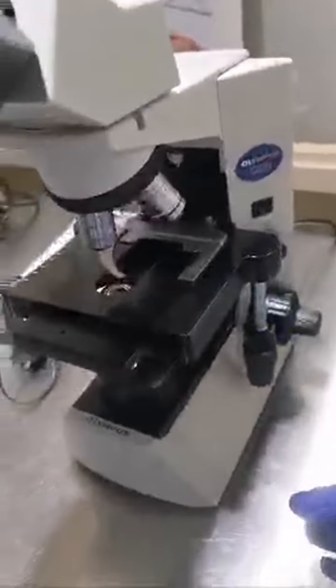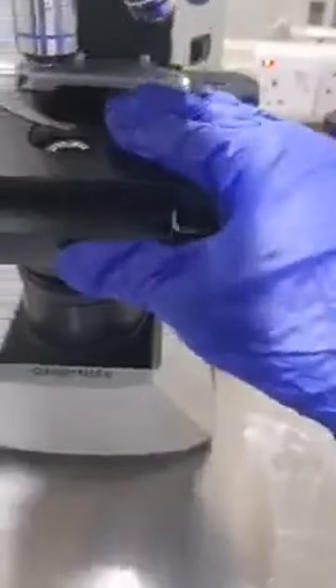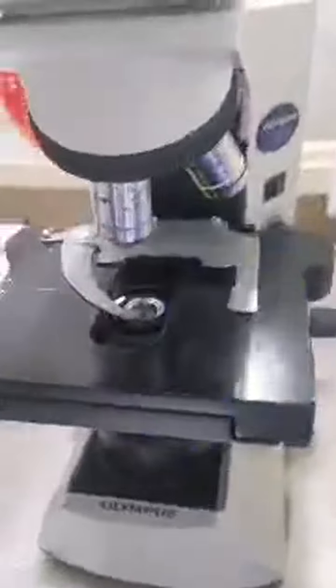For example, the microscope is here. Then you try to turn it on. Then you try to open this one and this one, and you try to adjust the light, and still there's no light coming out. Check if you plugged this thing in because maybe it's unplugged.